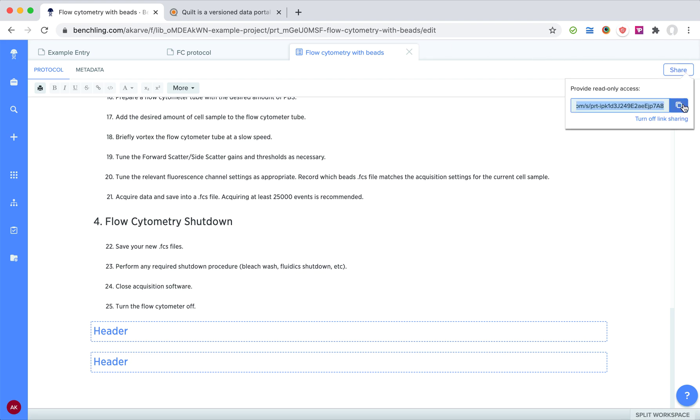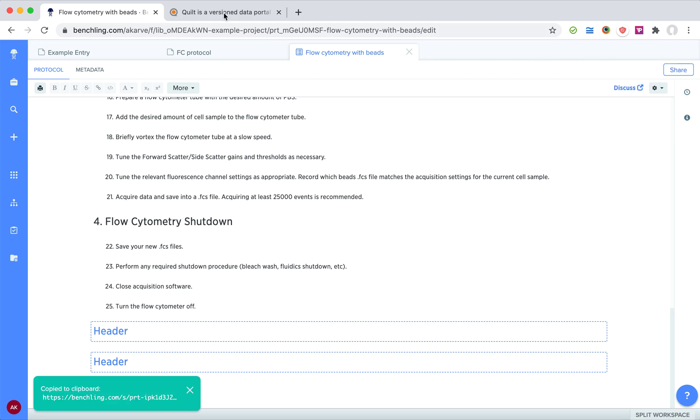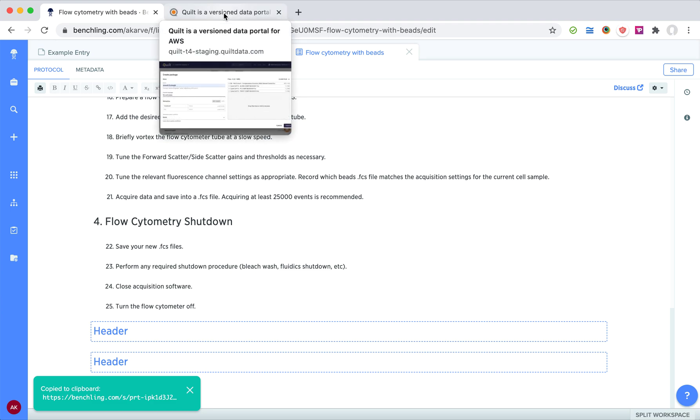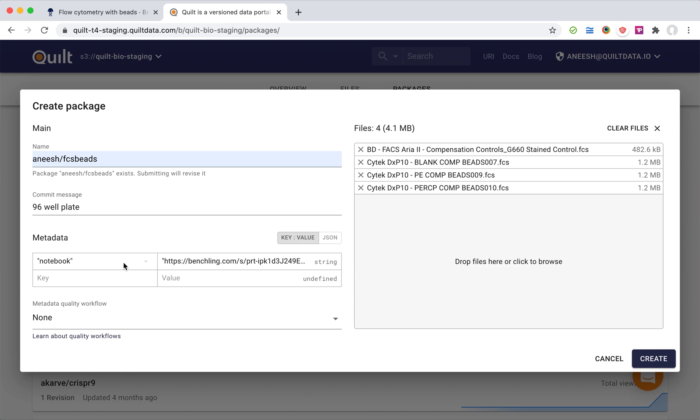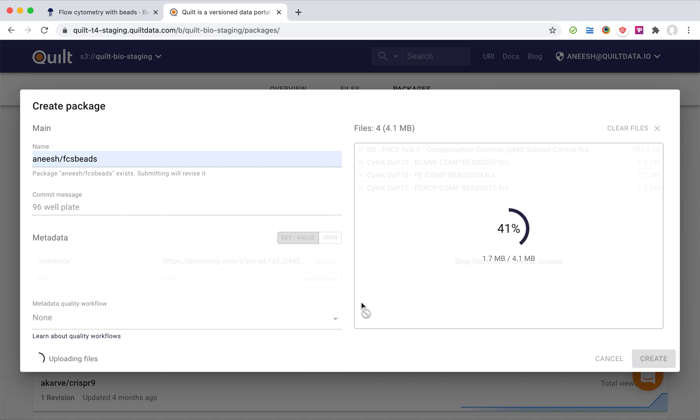The way I'm going to do that here is I'm just going to copy that shareable link and put it in this notebook field. I can create fields of any type that I want, and I've done that here. I'm going to click create now, and what's going to happen is this is going to actually back my dataset up to the cloud.